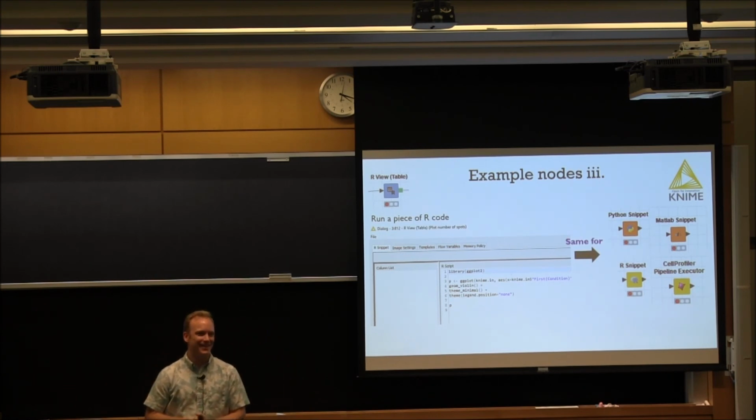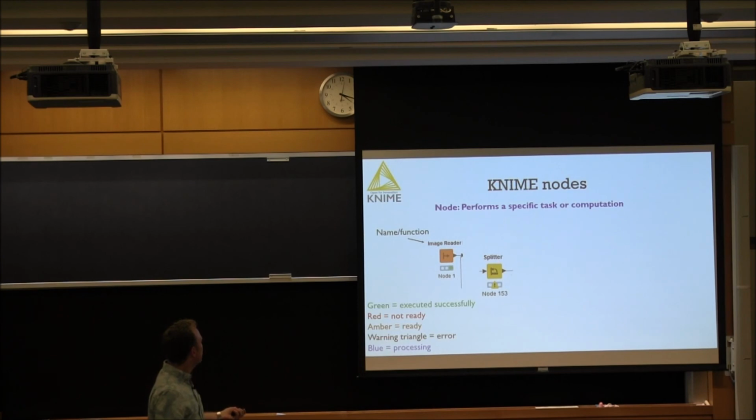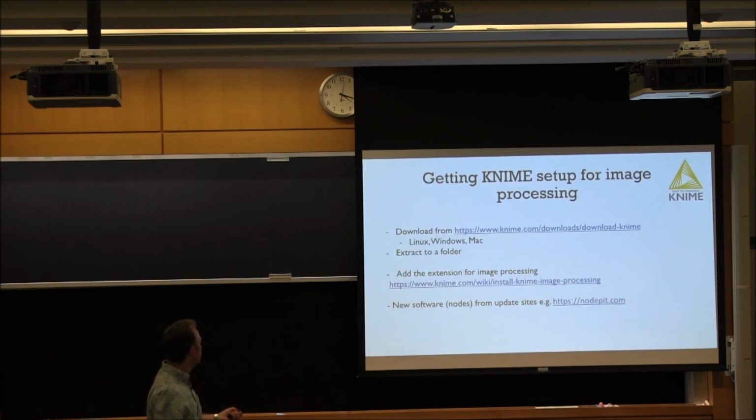And are there samples to work with? There are. If you go onto KNIME and then find the image processing section, there's actually a series of tutorials to take you through all these basic points, but also more complicated ones. If you go to ImageSC, those guys will sort you out within a day. So yeah.